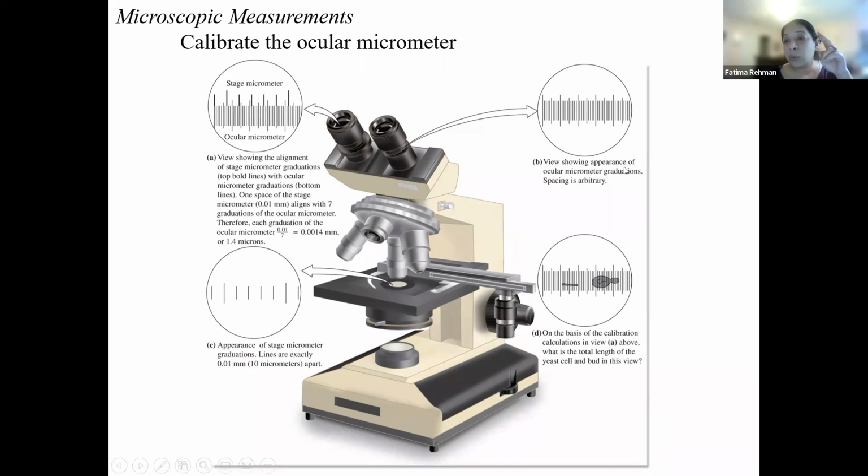And the second is that we still need to know how big it is. What is one unit equal to? Is one unit equal to 1 millimeter, 1 nanometer, 1 centimeter? What exactly is each one of those tick marks for this microscope? Because all of you saw that ruler in the eyepiece last week, right? In one of your eyepieces, there was that ruler.